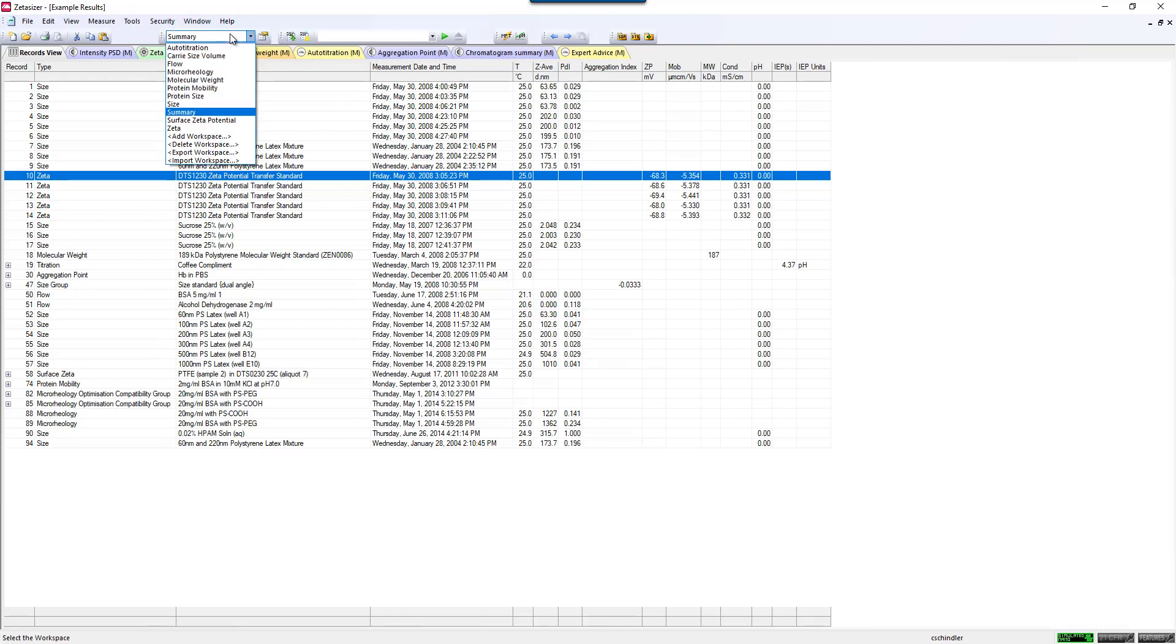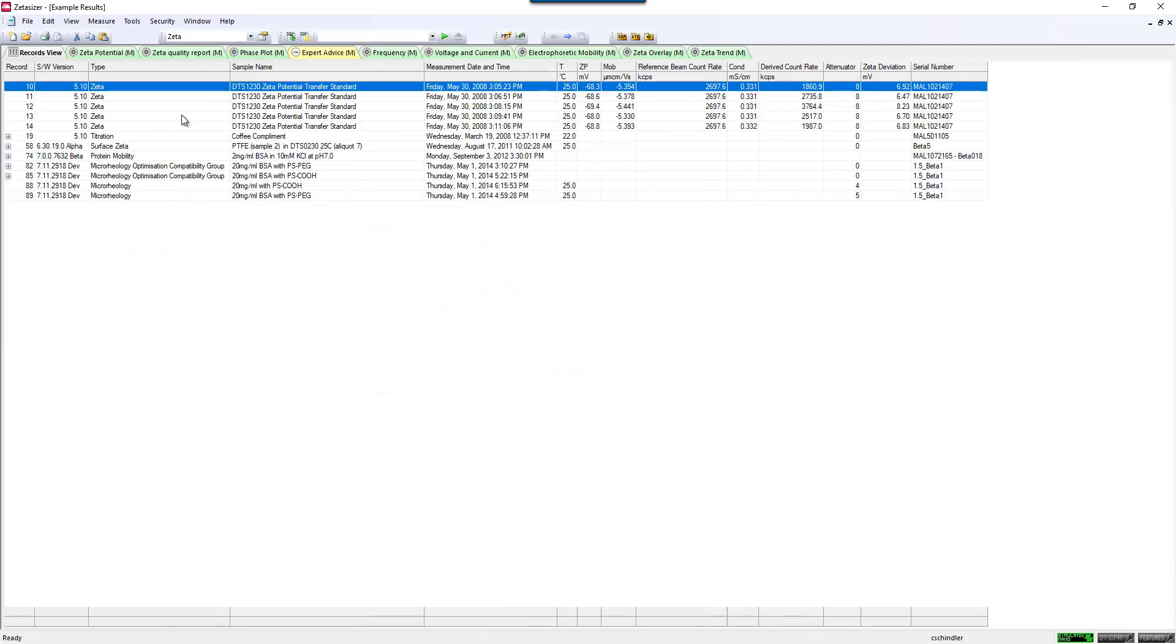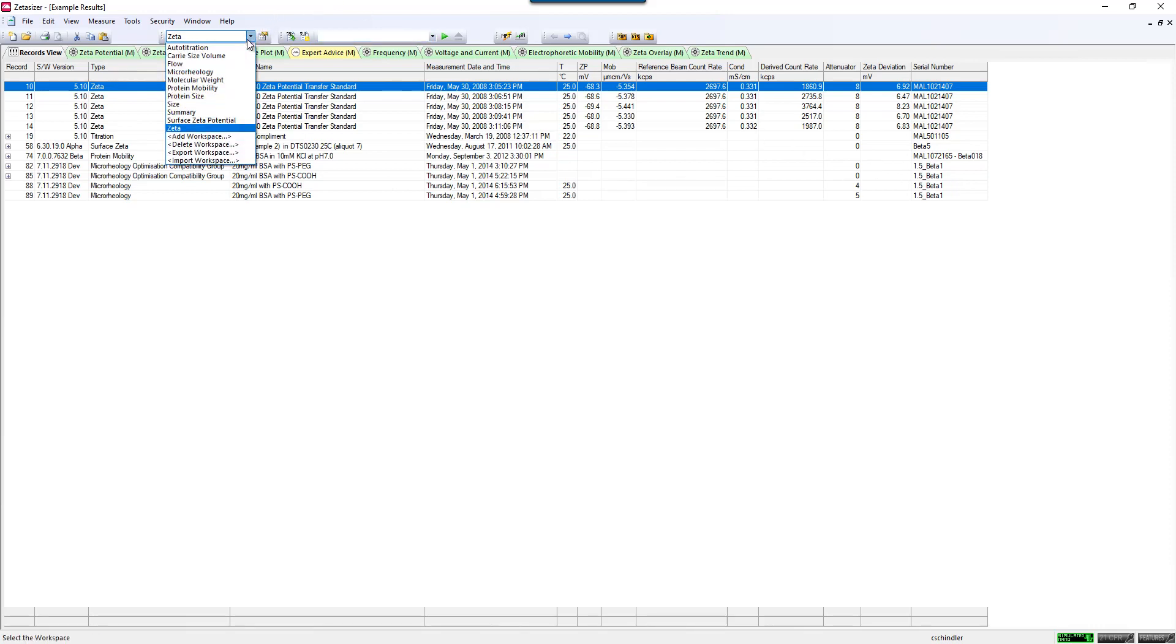There's a lot of different default ones. You'll see a summary one that shows all different types of measurements, and then there's measurement-specific ones, such as the Zeta Potential one that gives you relevant tabs and relevant information for a Zeta Potential measurement. You can customize all of these to meet your needs, and I've done a couple of them you can see here where I've displayed parameters that I would like to look at.